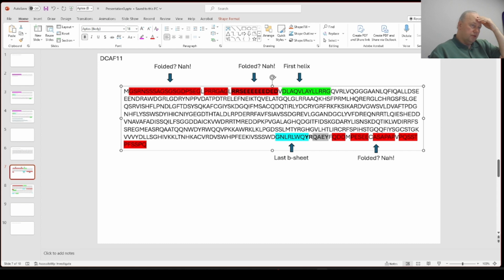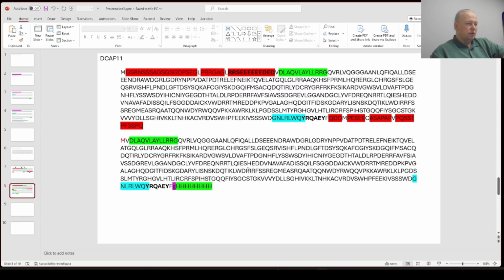And then these residues in black, or in bold, are strongly conserved across distant, deliberately picked distant orthologs. So there's conservation here, which indicates that maybe cutting after this F is advised. And so the construct that we can come up with is shown here. Obviously need an initiator methionine, and the first residue of the protein, the last residues of the protein, and then a small G spacer in purple, followed by an uncleavable C-terminal His tag.